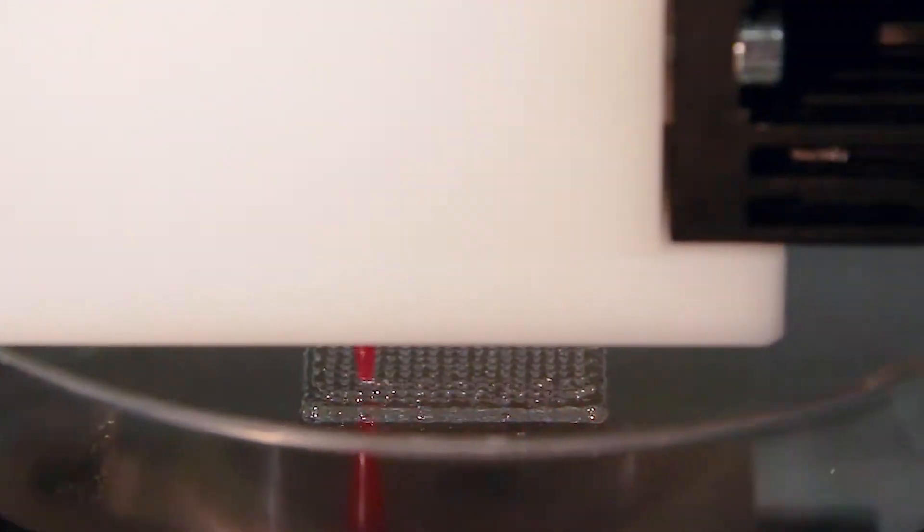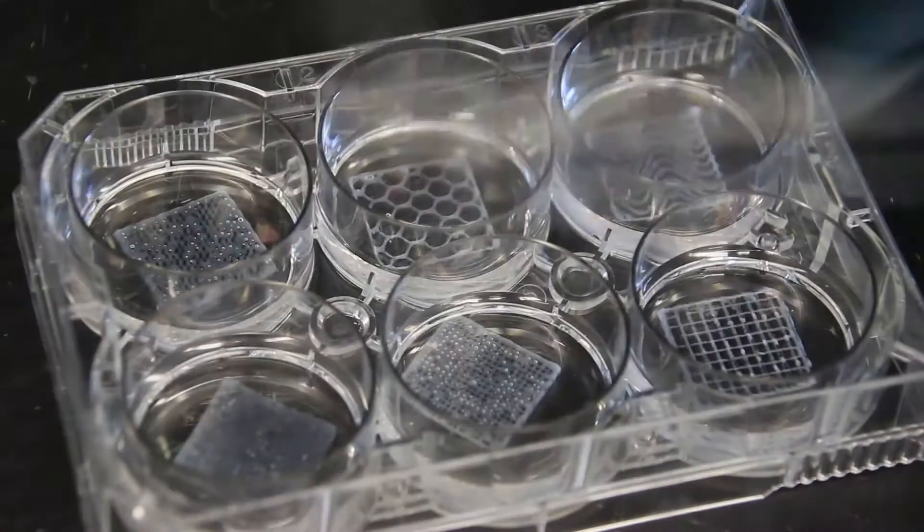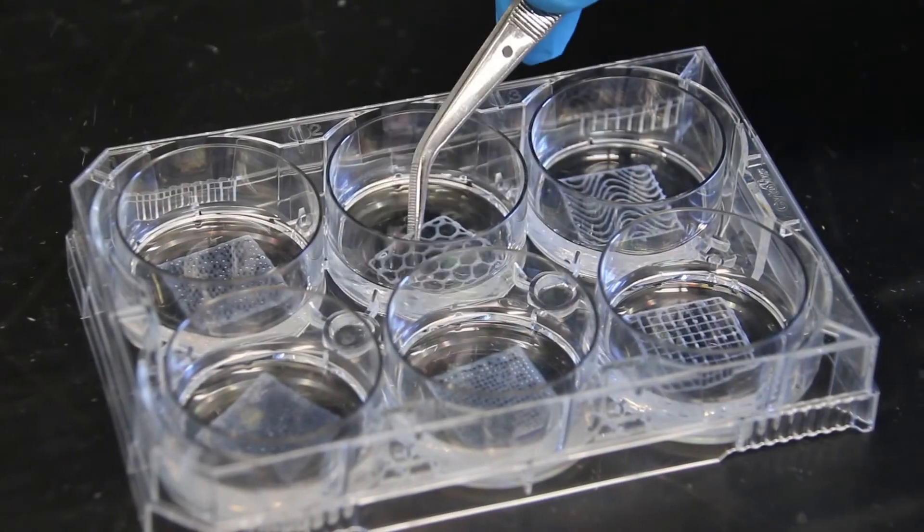One nice aspect of using the EnvisionTech printer is the complete control. We have complete control over the temperatures of the materials, the temperatures of the plates on which they're deposited, and the geometries down to micron-scale precision.